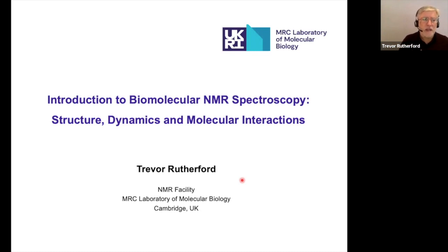And then we'll take a wider overview look at the broad scope of what NMR is capable of doing. Then later in the week, Jane will look at some more specific examples of exactly how you apply it in our context.